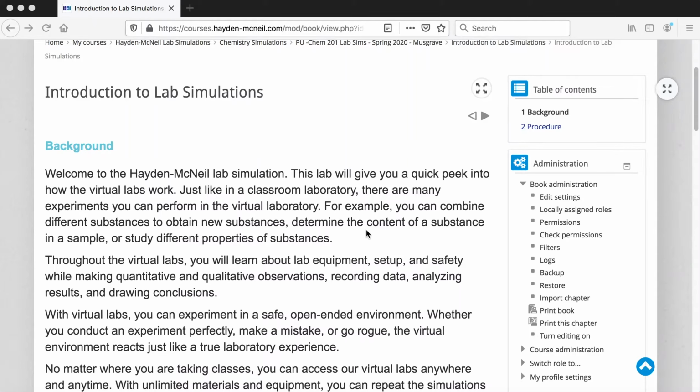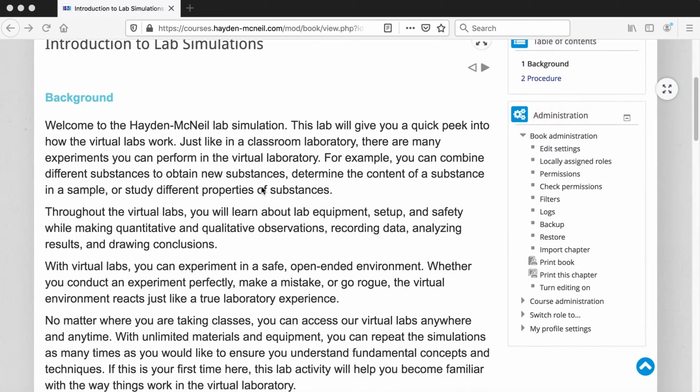This video is to give you an introduction to the Hayden McNeil Lab Simulations. This particular lab is called Introduction to Lab Simulations, and it will serve the purpose of allowing you to discover what's in the lab and how to use the equipment in the simulated lab. So what you'll see first is, of course, the title and then some background.